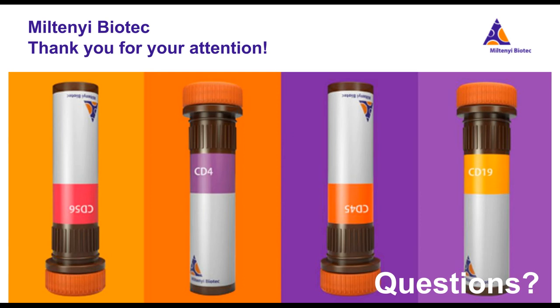As I showed you, the antibody was built on a human IgG1 isotype. So if your panel consists of markers that are all in just one fluorochrome, which of course is not always the case, then you use the same isotype. If you have multiple fluorochromes, obviously, because the conjugates will perform differently, one has to include the multiple fluorochromes.